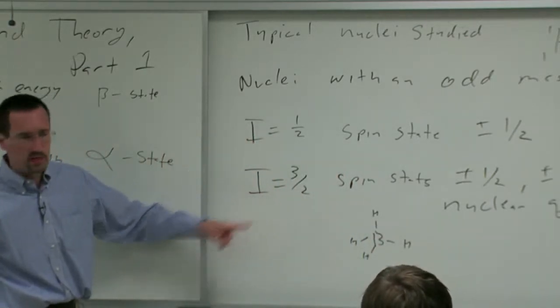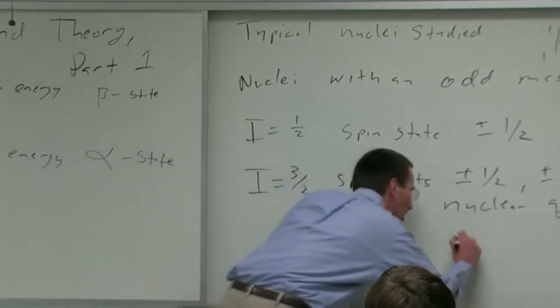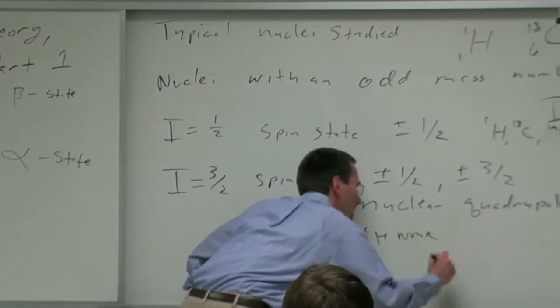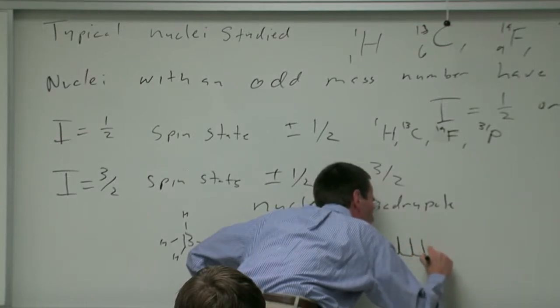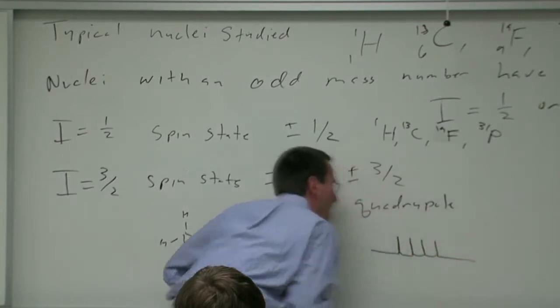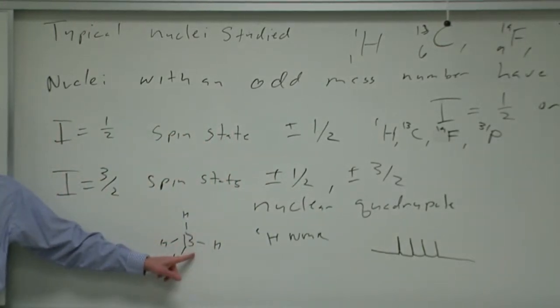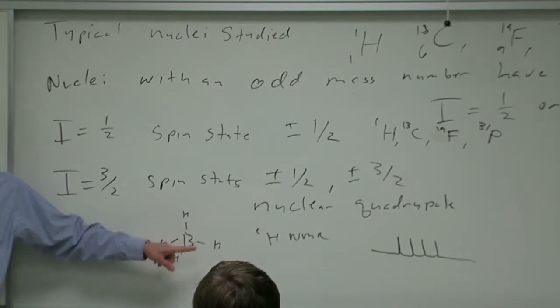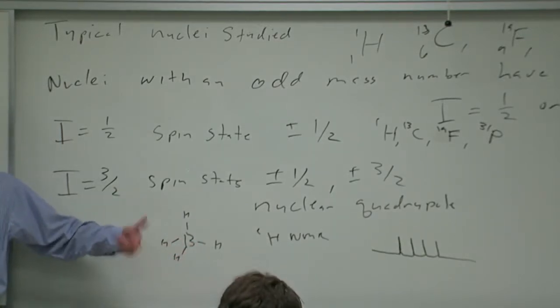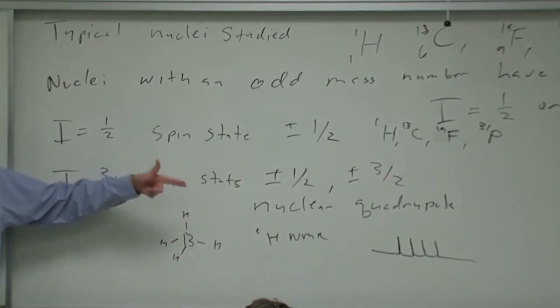And if you look at the NMR spectrum of borohydride, what you see in the H1 NMR is 4 lines equally spaced and of equal height due to the hydrogens coupling with the nuclear quadrupole. And it's very unusual because normally we think about splitting into a doublet, or a 1 to 2 to 1 triplet, or a quartet, a 1 to 3 to 3 to 1 quartet.